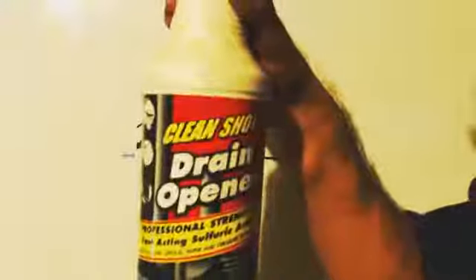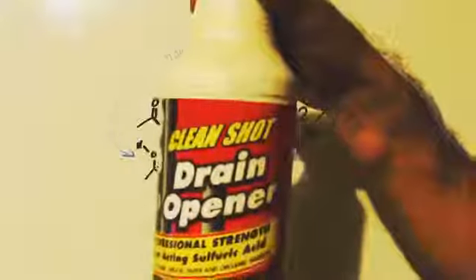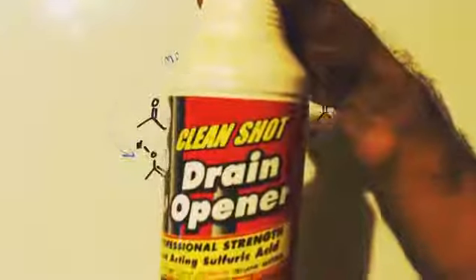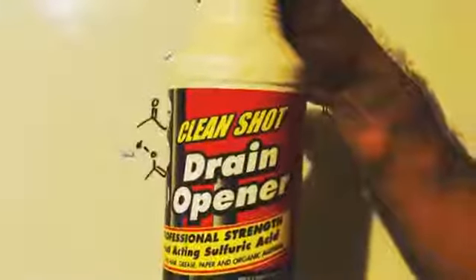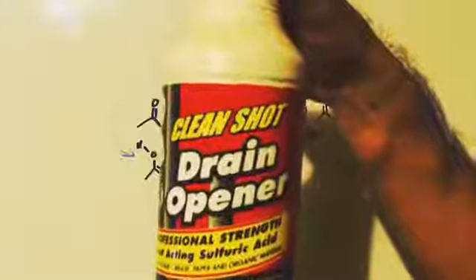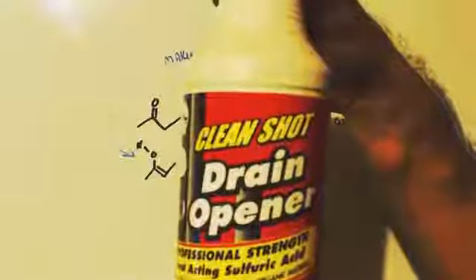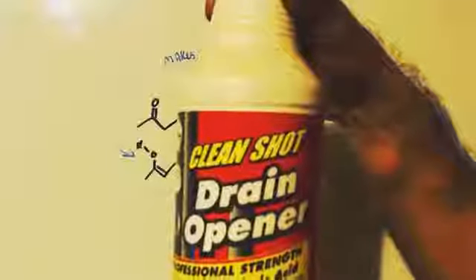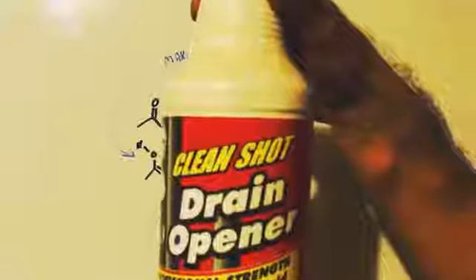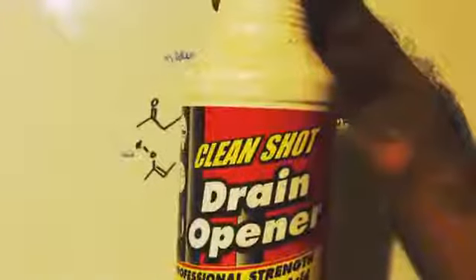Keep in mind, I know the rule of thumb is you pour acid into stuff, you don't pour stuff into acid. But when it comes to peroxides, the rule is reversed. Peroxides trump acid. If you're going to mix acid and peroxides together, you always pour the peroxide into the acid. If you do it the other way around, like I said, you'll blow up with the wrong concentration.